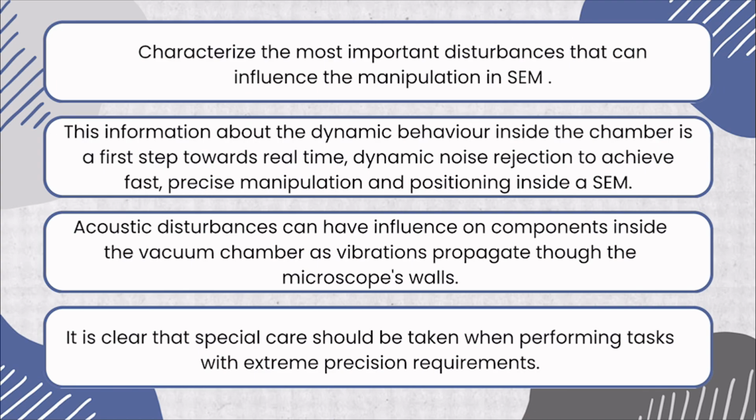Third, the author also demonstrated that acoustic disturbance can enter through the microscope's walls, impacting accuracy inside the vacuum chamber.